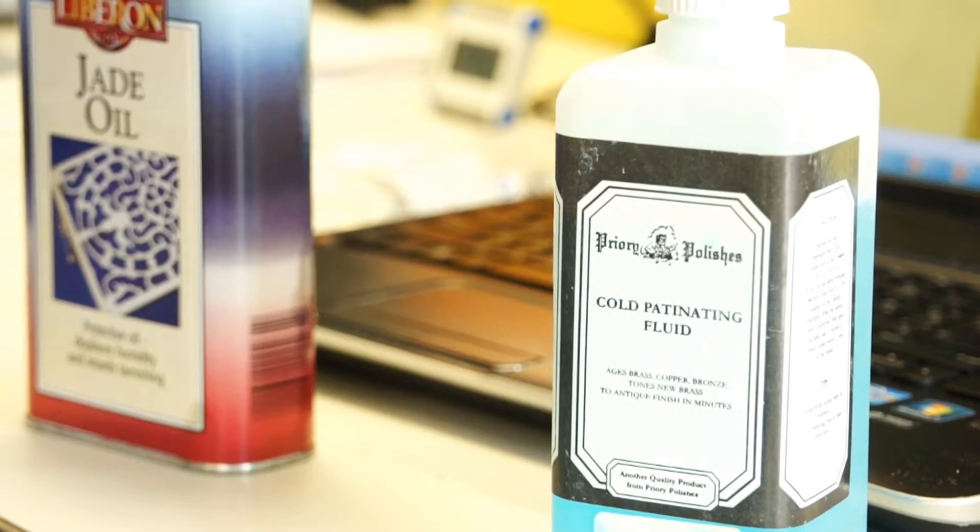I do this by using antiquing fluid. The antiquing fluid reacts to the metal of the cartridge, and then whatever fingerprints or marks are on it will develop and provide a more enhanced visualization of the fingerprints on the cartridge casing.